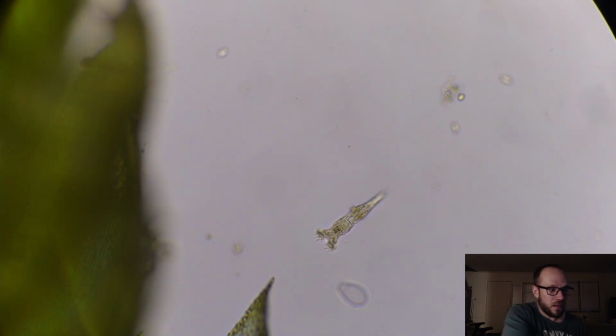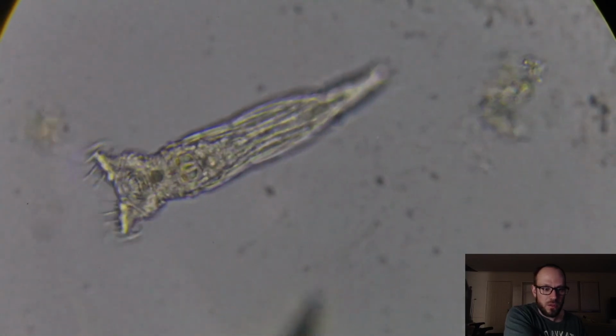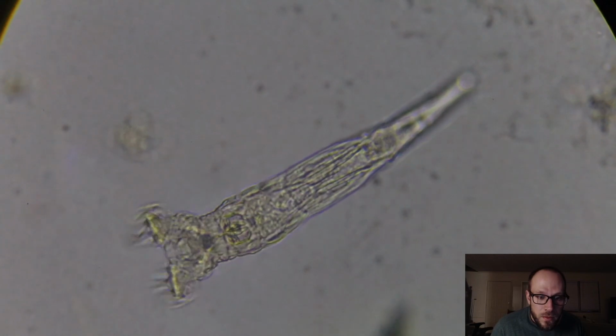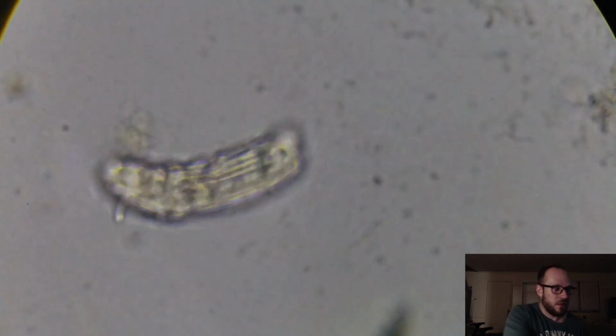He's just doing his thing. I just think this is so cool. All right, let's do 400x. We'll really see what this guy's about. 400x, though, is like... There we go. 400 times larger than you could see him. Yeah, there we go. You can really see it pumping now. It's moving more slowly. I've seen it pump faster on others.